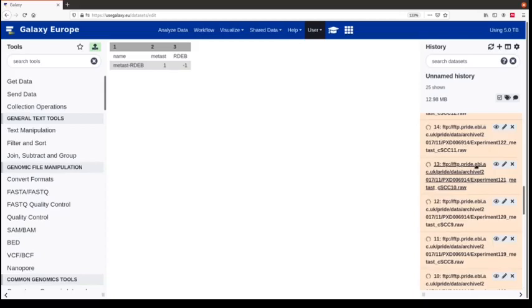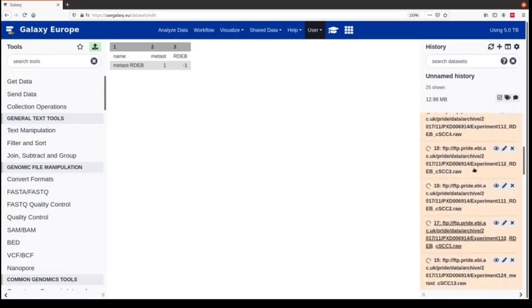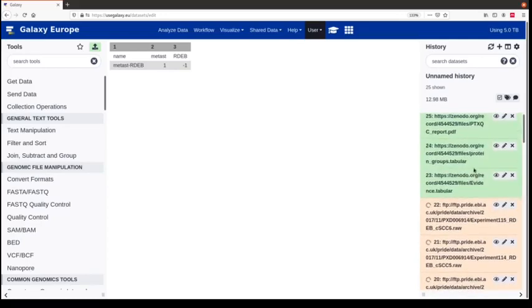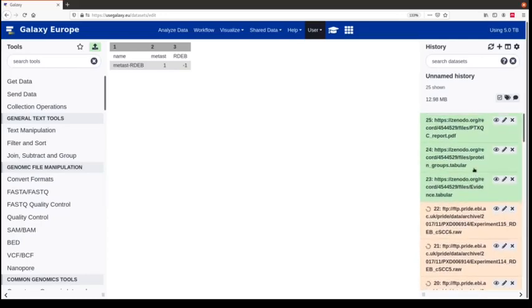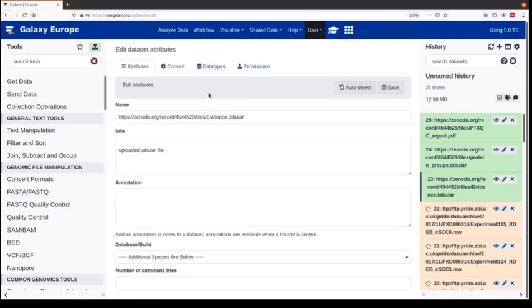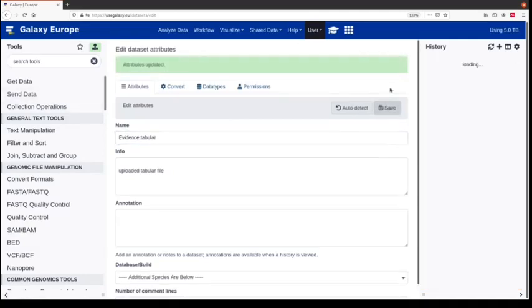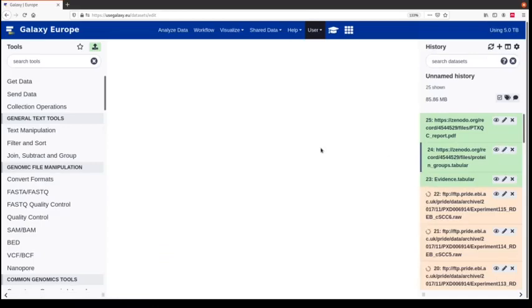You can see that the raw data is still downloading, which is not typical for Galaxy trainings. We often use cropped and very small but descriptive data files, but in this training we actually use a real cohort and didn't crop the files to get a proper statistical analysis. We don't have time in the training to wait for the MaxQuant run to finish. Therefore on Zenodo you can already get the results of the MaxQuant run — the evidence output, the protein groups, and the quality control report.